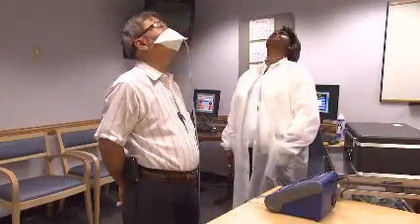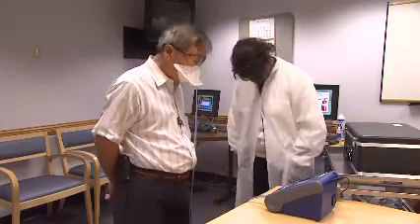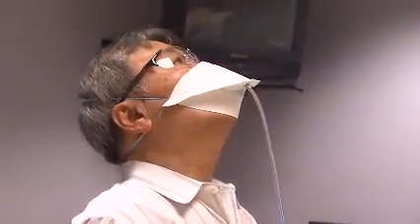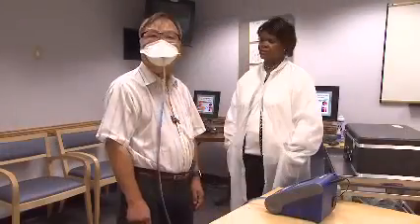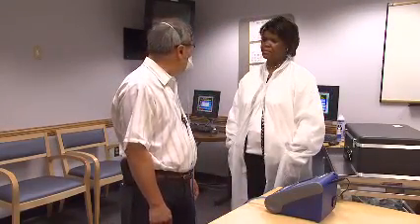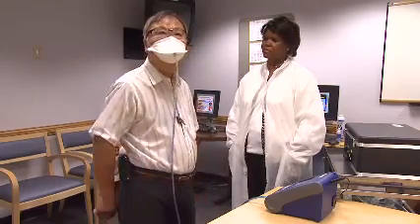So what is a fit test? A fit test tests the seal between the respirator's face piece and your face. It takes about 15 to 20 minutes to complete and is performed at least annually. After passing a fit test with a respirator, you must use the exact same make, model, style, and size respirator on the job.